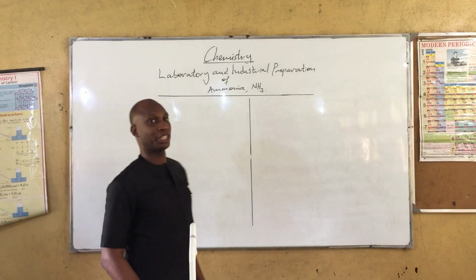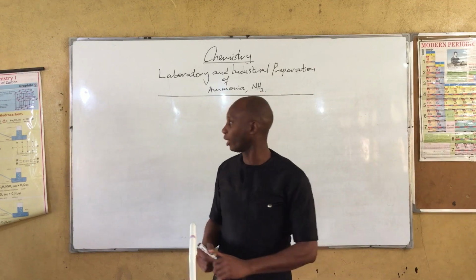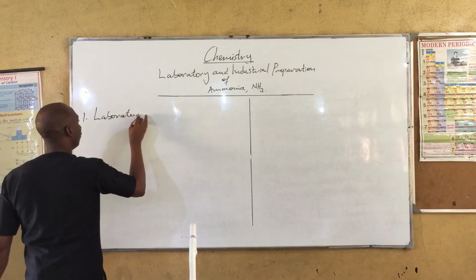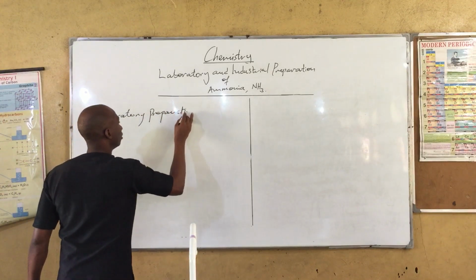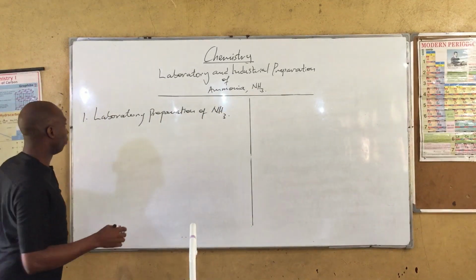Today we shall be talking about the laboratory and industrial preparation of ammonia. So quickly, let's look at number one, the laboratory preparation of ammonia gas. Let's see the following procedures.